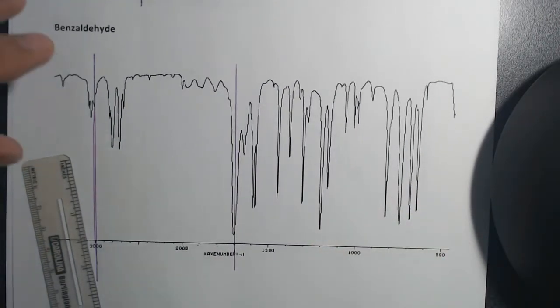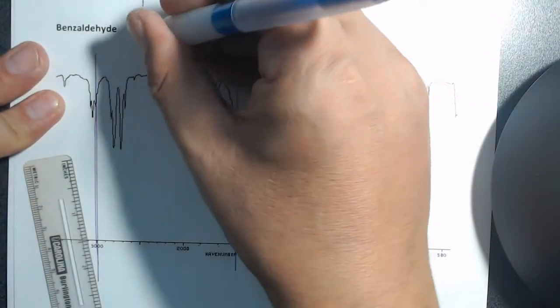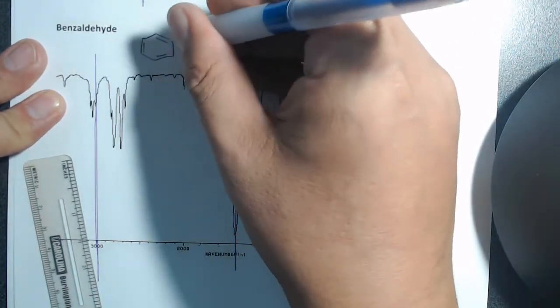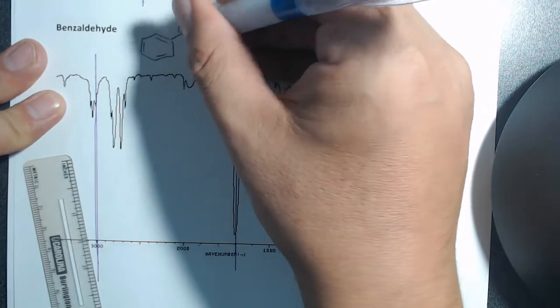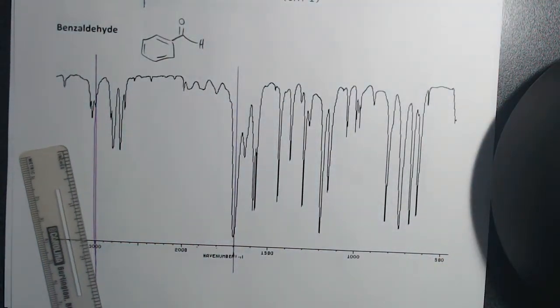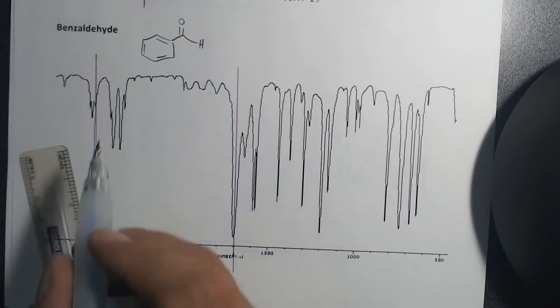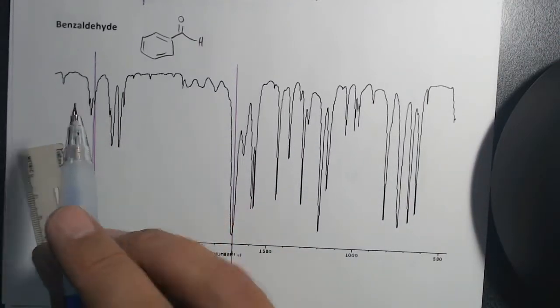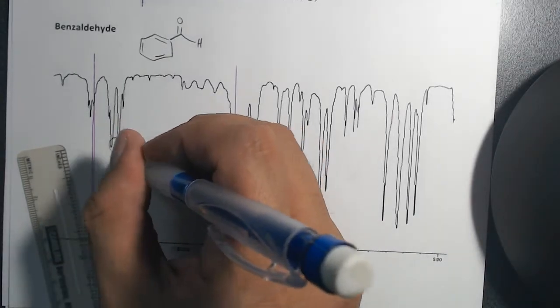And just so we're clear about what compound we're talking about here, it is benzaldehyde, commonly referred to as bitter almond. It has a benzene and an aldehyde group. No alkanes, so we're not seeing any alkane. Notice how there's kind of a gap there. Did you guys by chance catch what this one is?